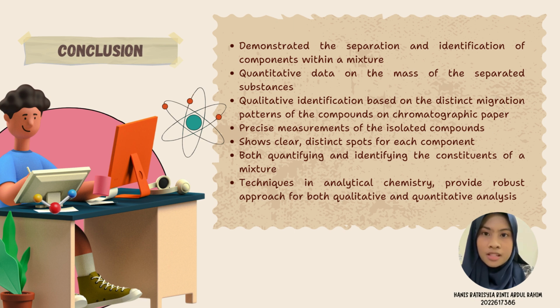of the mixture. The results confirmed the reliability of these techniques in analytical chemistry, providing a robust approach for both qualitative and quantitative analysis. Future experiments could explore the application of these methods to more complex mixtures to further evaluate their efficacy.